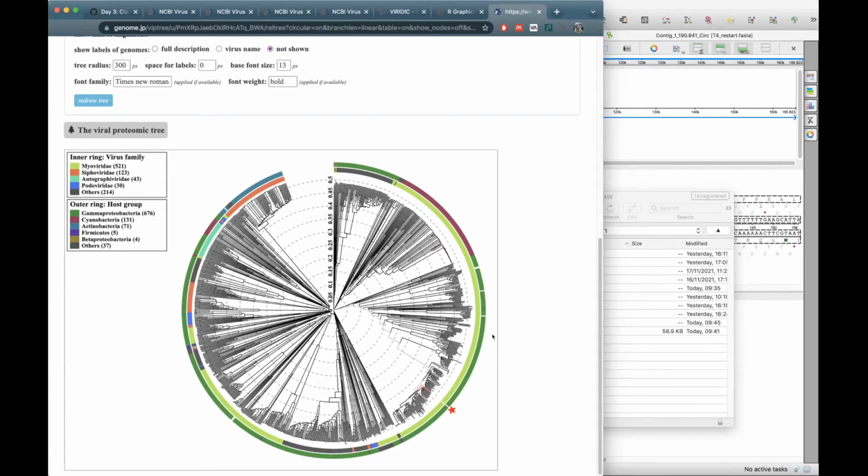Okay, yeah, so as you can see, this apple green, as you said, is here, but it's also on this side and on this side, and those two share nothing. So you can't use Myoviridae alone, that's what I was illustrating, and that's why we're getting rid of it. So these ones will be, in the next taxonomy release, at least two new families, like I showed you in the presentation.